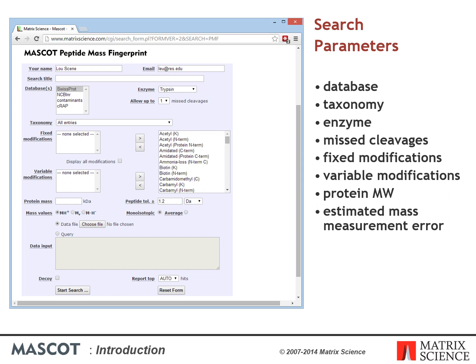This is the Mascot search form for a peptide mass fingerprint. Besides the mass spec data, a number of search parameters are required. In theory, you could design a search engine that didn't require search parameters and tried to work everything out from the mass values, but this would be very inefficient. If you know the enzyme was trypsin, it's much easier to supply this information as part of the search.